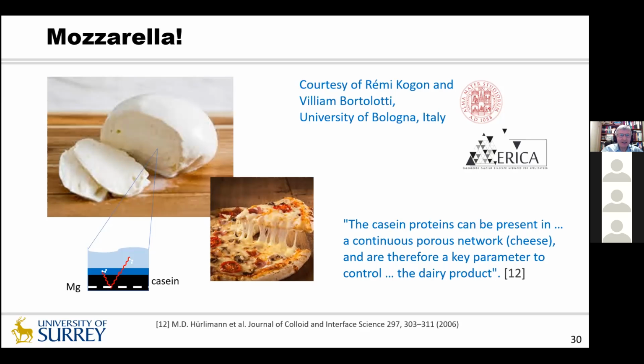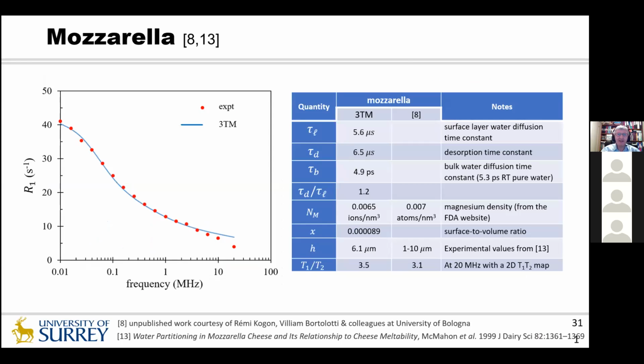But let's have a look at the data and see what we have. And here it is. And it's really rather good. Lots of very typical standard numbers in here. One query I would say, and they identified this, the low value of tau B and a rather weak fit to the data at the right-hand end here. Everything else is really quite remarkably good.